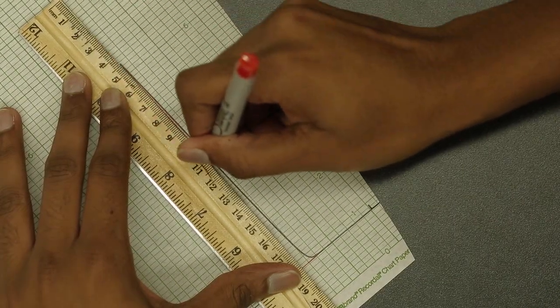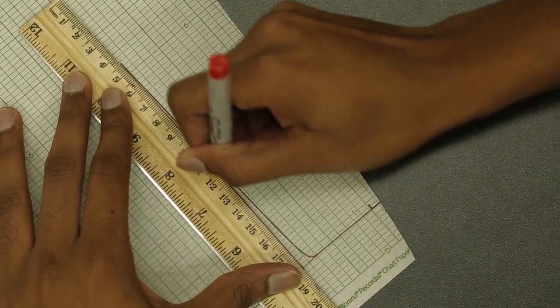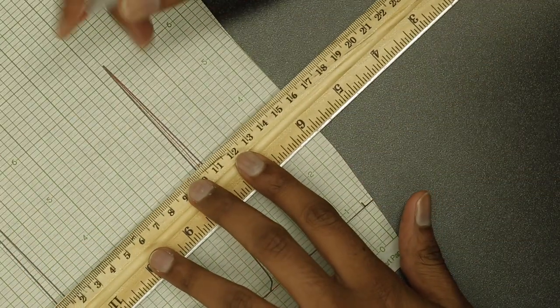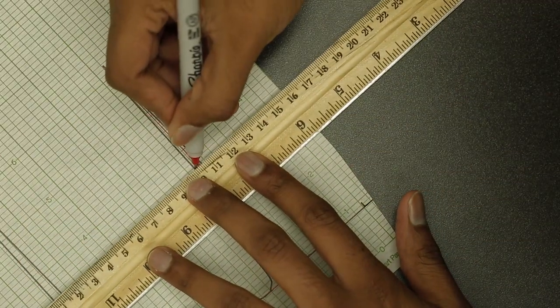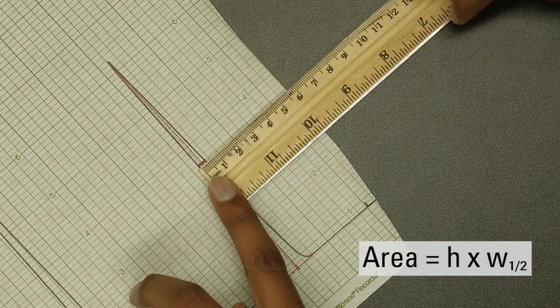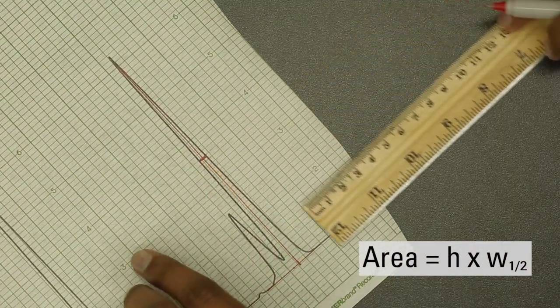To calculate the area, measure the height of the peak from the baseline and measure the width of the peak at the half height. The area of the triangle is equal to the product of the height times the width at half height.